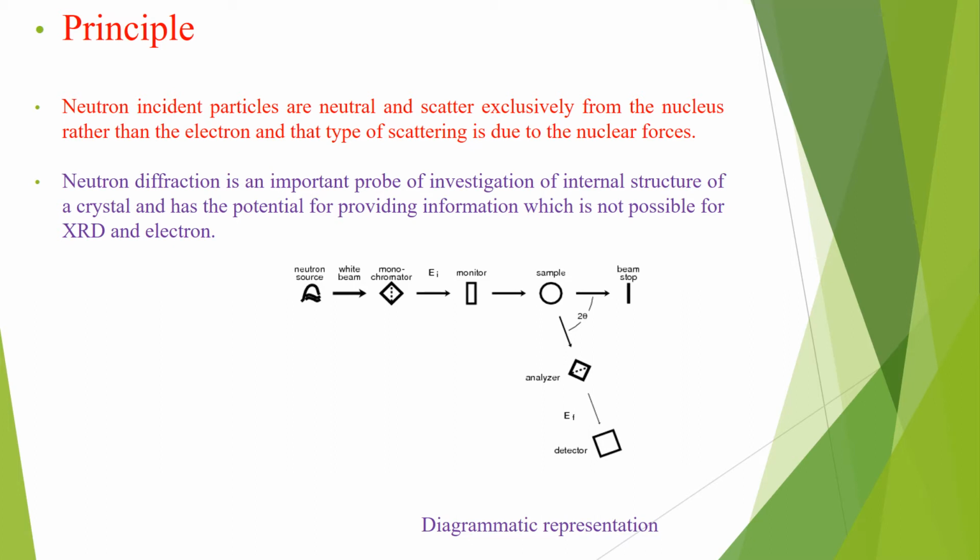Dear student, in this slide we are going to discuss the principle of neutron diffraction. Neutron incident particles are neutral and scatter exclusively from the nucleus rather than the electrons, and that type of scattering is due to the nuclear force.